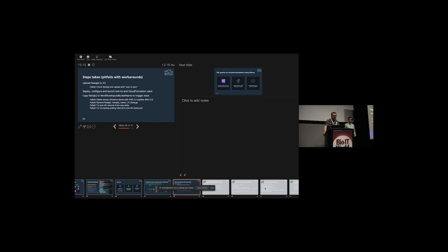Then the other thing that I ran into was I'd also been doing a lot of omics research for another customer, and I'd created a lot of reference stores. So when you run this, it tries to create an HG38 reference store for you, but there's a limit to how many you can have. So I'd already exceeded that limit. So the first time I tried to run it, it says, nope, can't do it. You have too many reference sequences.